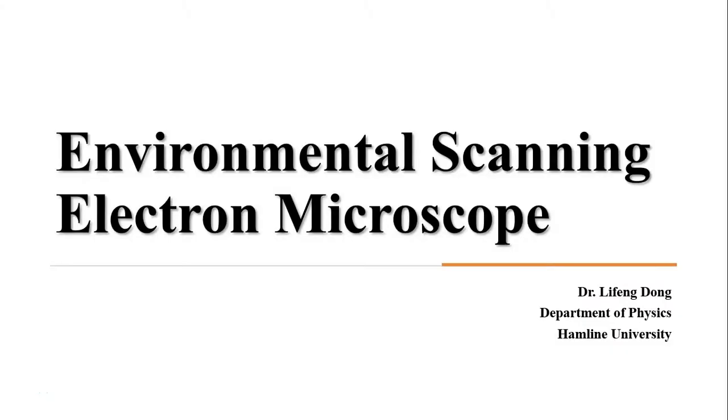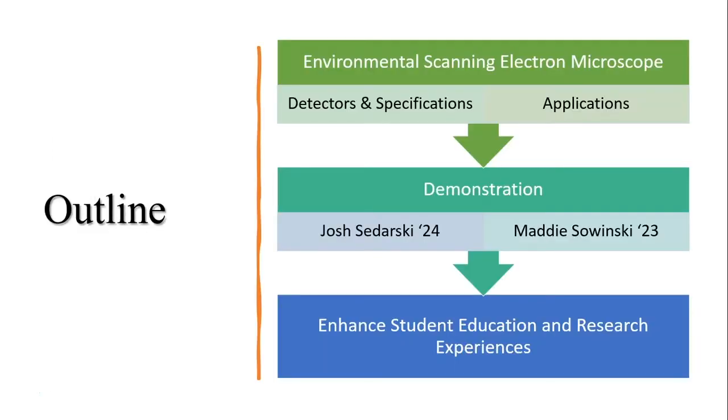This webinar will talk about the Environmental Scanning Electron Microscope, or ESEM, at Hamline University. It includes 3 parts: detectors, specifications, and applications. Josh and Maddie will demonstrate how to use the ESEM for our research project. They will talk about enhanced student education and research experience.